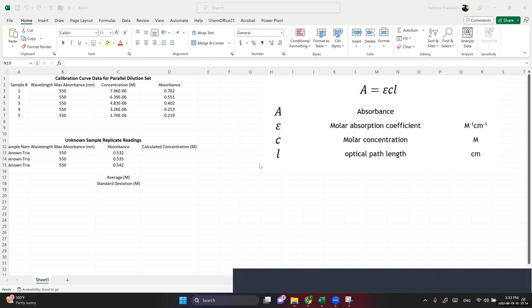Today we are going to see how we can solve for Beer's Law — some people say Beer-Lambert Law as well. Simply, Beer's Law says that the absorbance of a solution is proportional to the concentration of particles in that solution: A is proportional to C. To make an equation, we introduce the constant epsilon, which is the molar absorption coefficient.